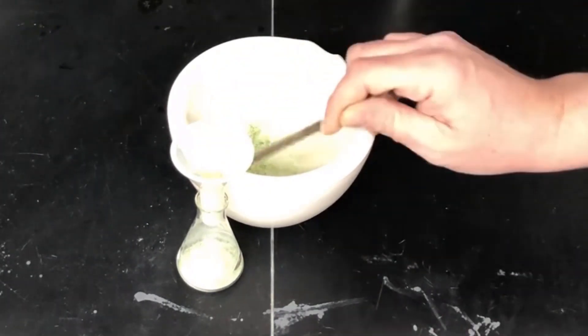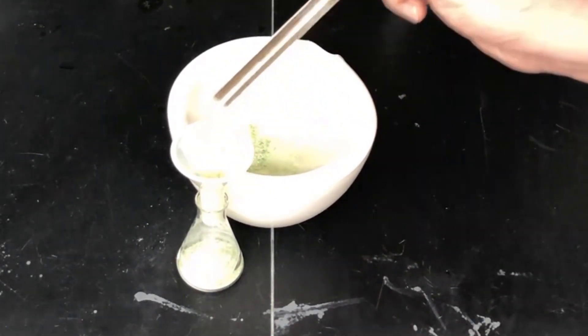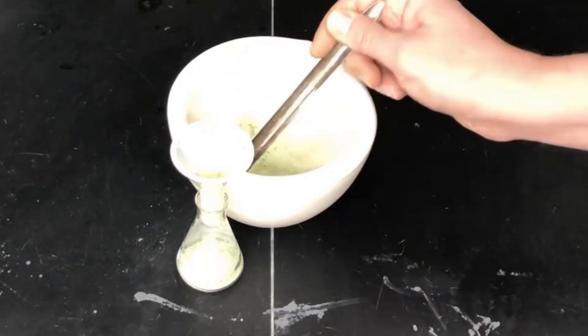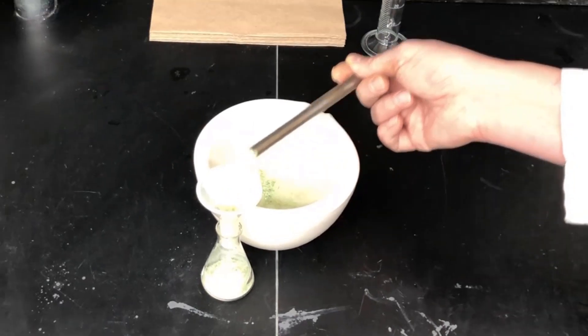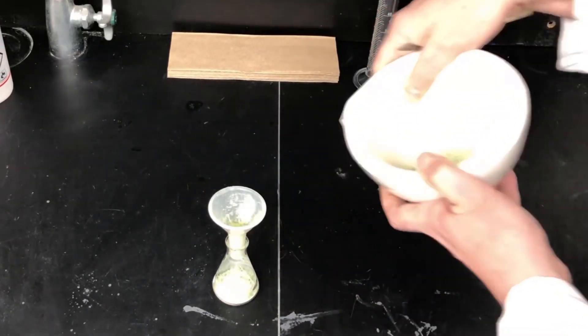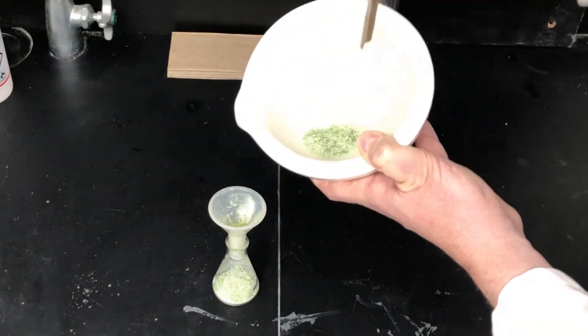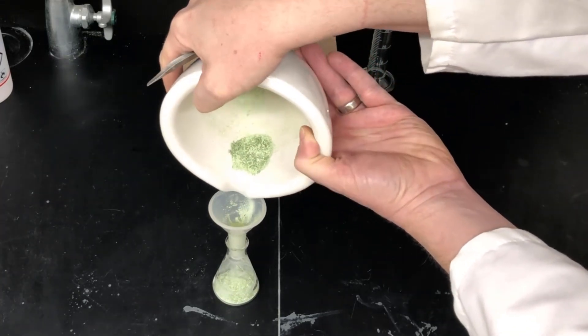Sometimes the fibrous material can plug the filter, so just be aware of that. That can be kind of a hassle, but get your solid material into the Erlenmeyer flask, and now I'm going to pour the last bits of it in.